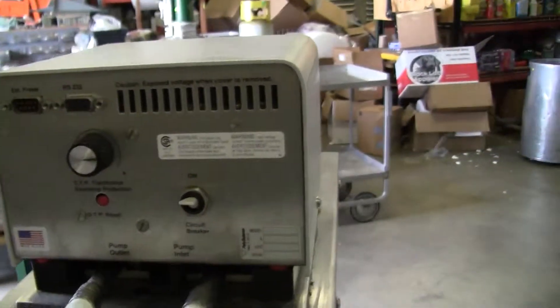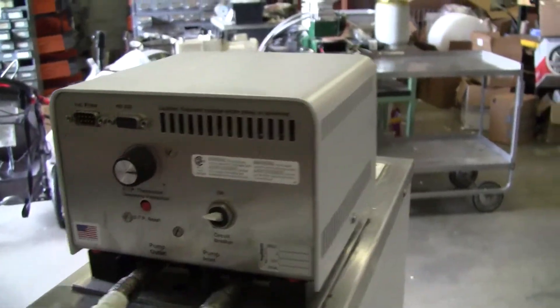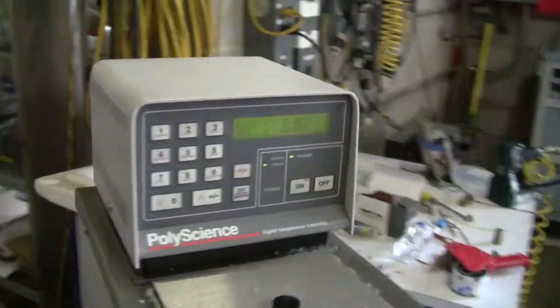This unit runs on 115 volts. Your overtank circuit breaker — you need to supply your own connections. That's our connections and tubing.